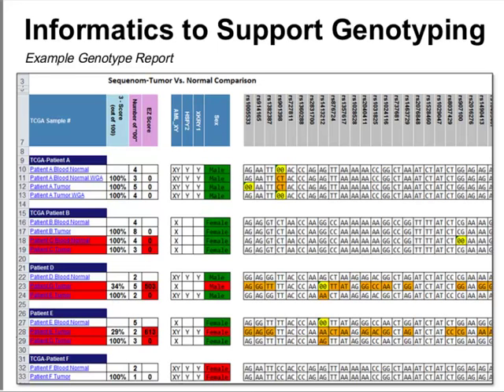None of this was done manually, other than I edited the patient IDs to make it generic and not release any TCGA-specific information. We have some additional QC data. It gives a quantitative summary of the homology between the samples, using the blood as the best normal, and how similar any other sample within that patient is to the best normal. It summarizes how many loci failed, and we had an internal quality metric that there had to be fewer than 10 failed loci for us to accept the genotype result.